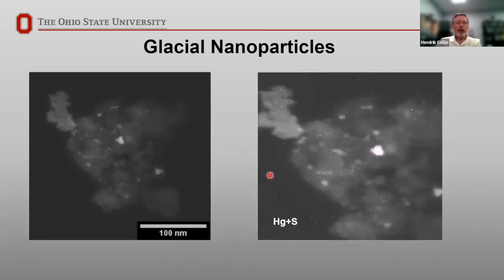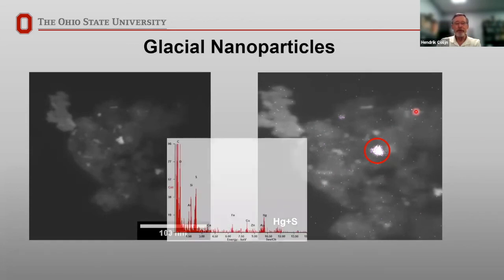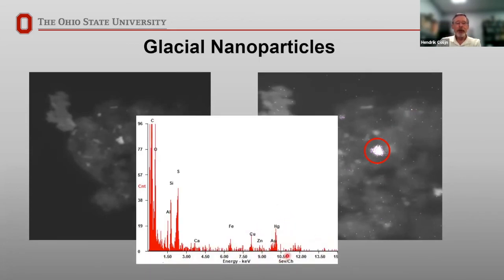So moving on, it turns out that this bright spot, which was scattering strongly, was not an iron particle, but it was high in mercury and sulfur. And when we looked at the X-ray spectrum from just those pixels, again, it showed a signal in mercury and a signal in sulfur. So this was a mercury sulfide particle that was embedded in there. And with this combination of materials, they deduced that this was some sort of a volcanic ash particle that had drifted into the glacier.